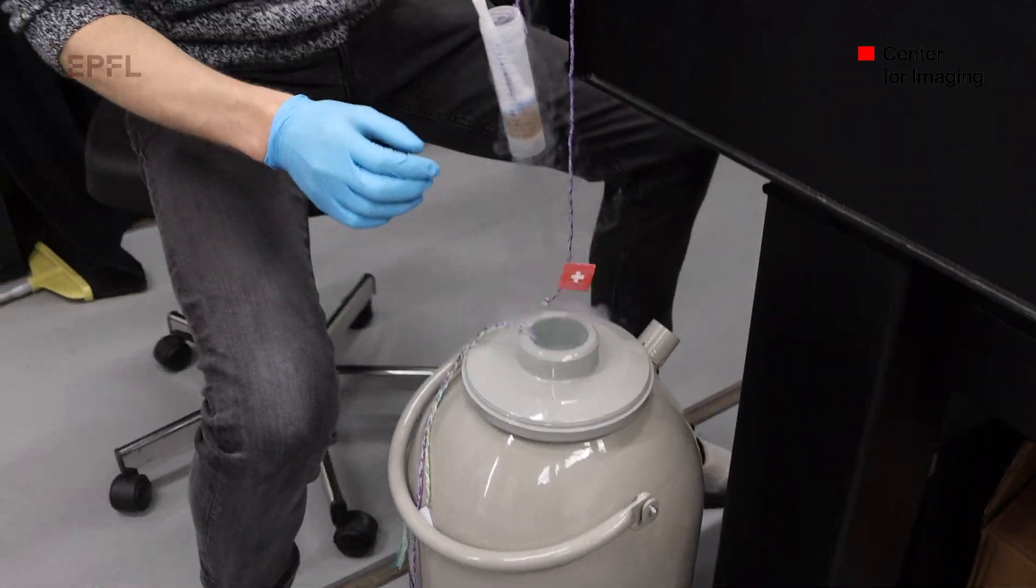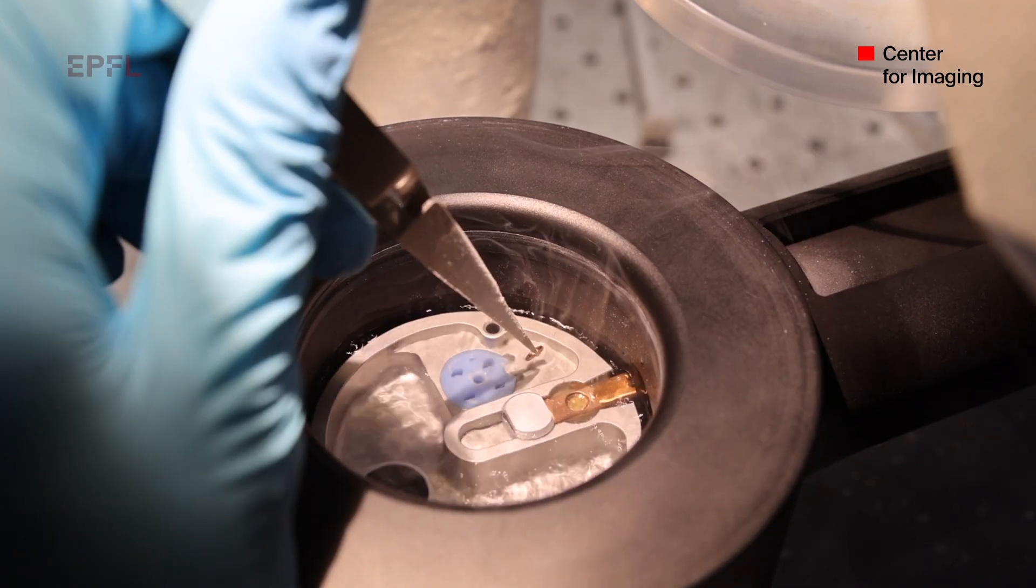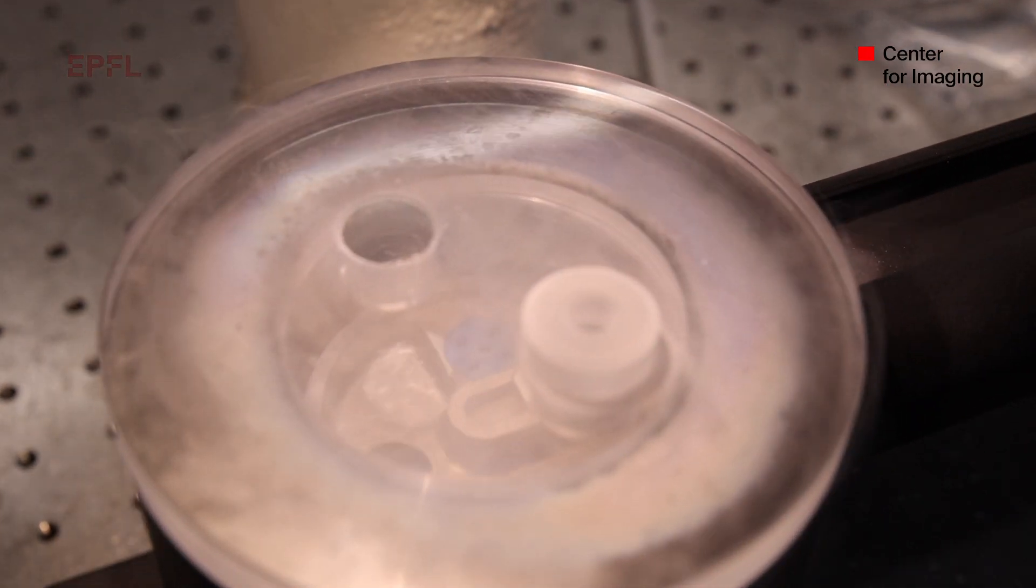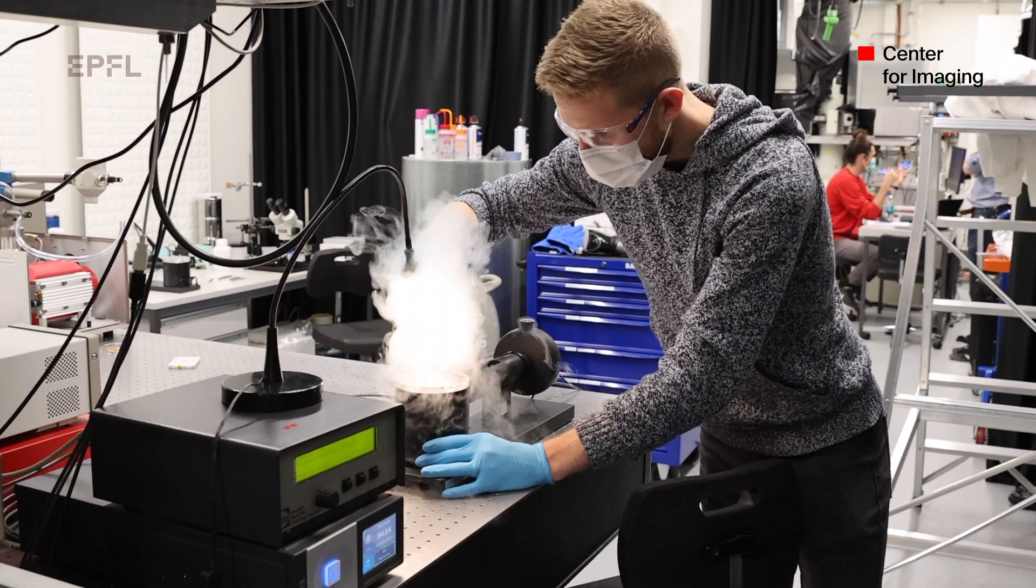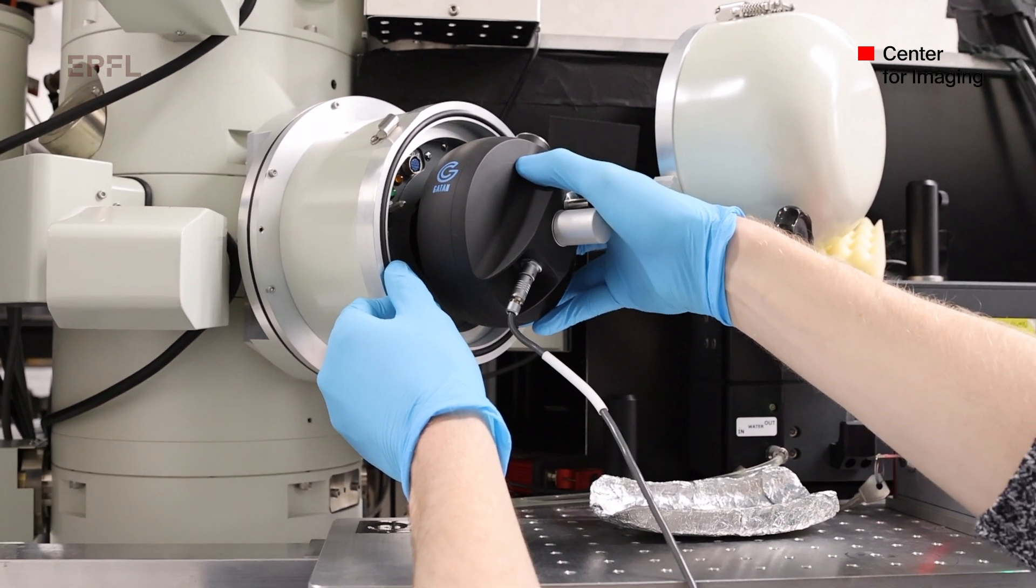Over the years, people have developed a number of ways to obtain structures of proteins. One of these techniques is cryoelectron microscopy. In simple terms, you take a very thin film of water with your proteins in it and plunge this sample into a cryogen. This way you freeze your sample very rapidly, which allows you to load the sample into a transmission electron microscope and record images of your protein.